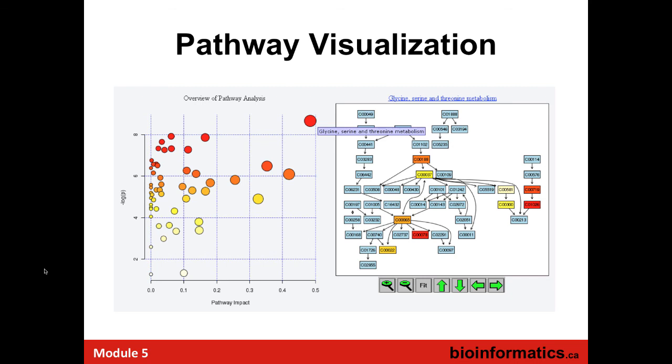Question? Sorry. What is the meaning of pathway impact, and what is the cutoff for the pathway impact? There's no formal cutoff for pathway impact, but it's calculated. The description and the calculation, I think, is in the original paper. I don't remember exactly the formula. Jeff might be able to tell you. The main thinking behind this is that pathways in the hub, in upstream, have more impact. So if your pathway is more located in a strategic or important location, it has more weight than one that goes downstream. So it's just a rank. There's no cutoff, just a rank.